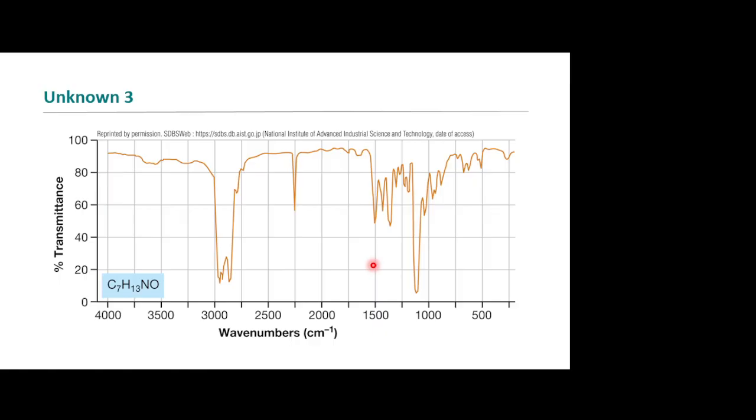I did that one just by looking at the spectrum. I didn't see the stuff here. But yes, you're right. That would be part of the checklist to do. And you'd look here. Again, I kind of did that because I said there were no hydrogens on any of these elements, right? And we also don't have the aromatic set.